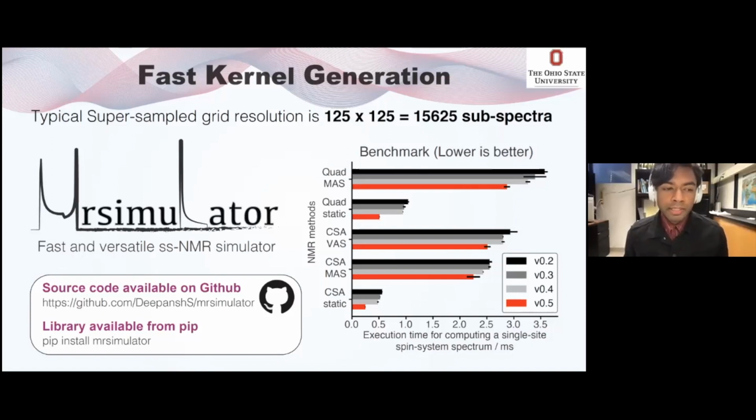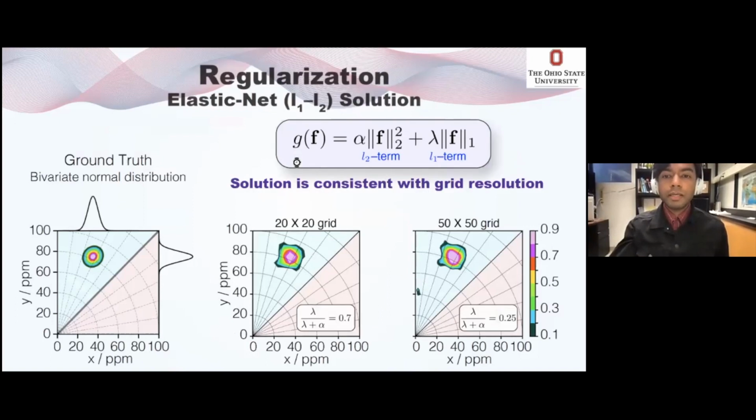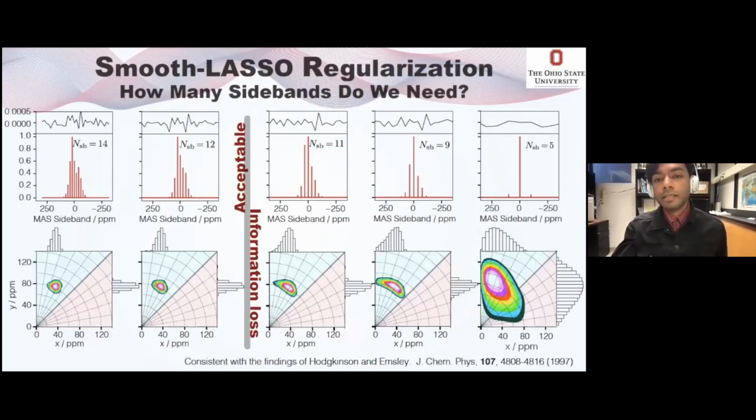If you remember the example that I showed in the case of sidebands, these are all uncertainties. One of them comes from the fact that you're removing a part of the anisotropy that you're trying to determine. So that leads to these uncertainties.